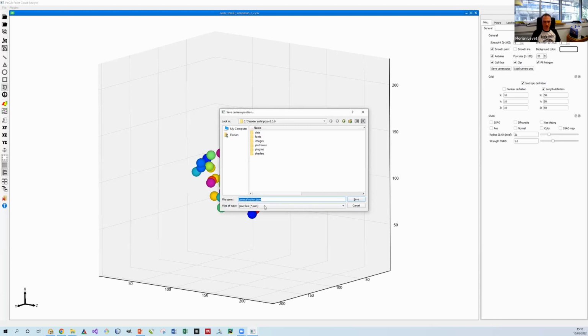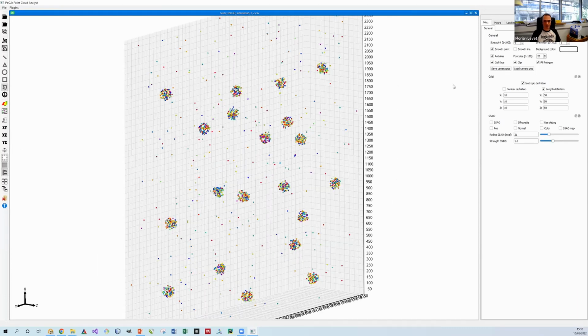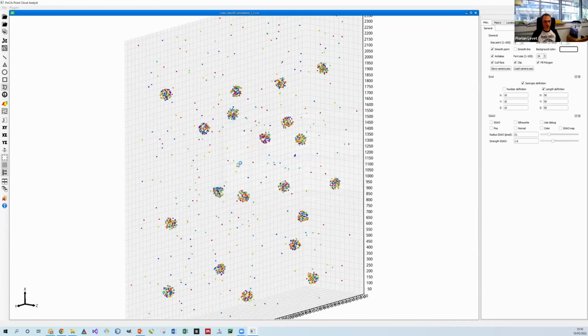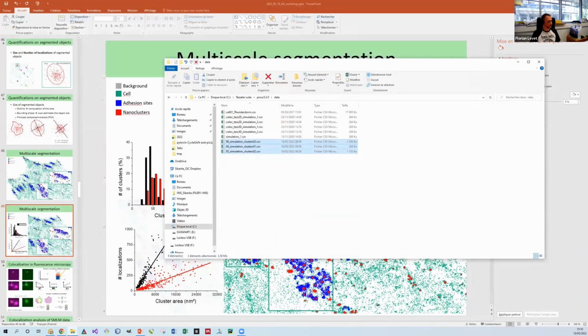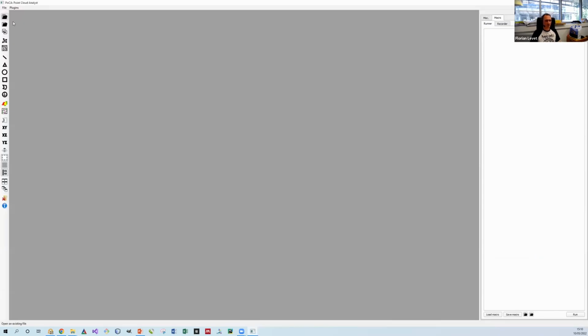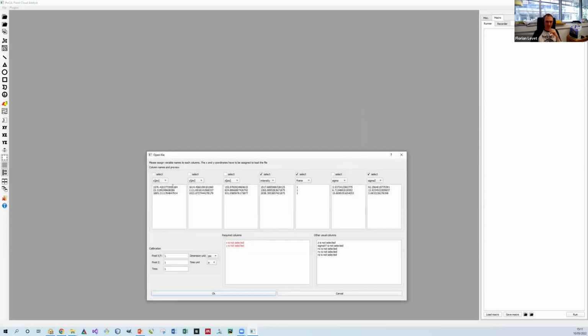So let's say that you want to save this camera position. And then you go back to that. If you save it and load it back, oh, maybe it won't work. Oh, it didn't work. So for now, I guess loading and saving the camera position is not a good idea. I must have changed something and I broke something else. But it will work at some point.